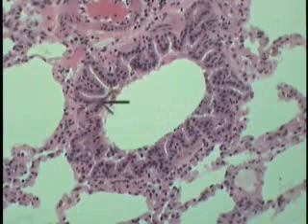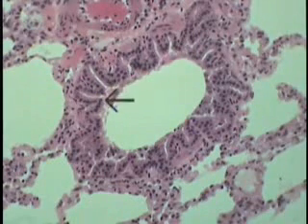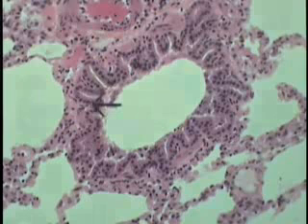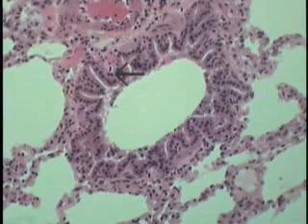Note also carefully the epithelium at this particular juncture. It is now definitely a very characteristic simple columnar epithelium, which may or may not maintain cilia at this point. Some of these tubules will.